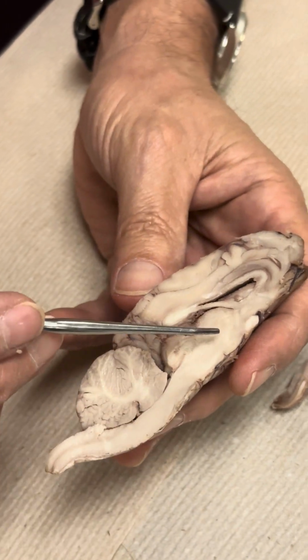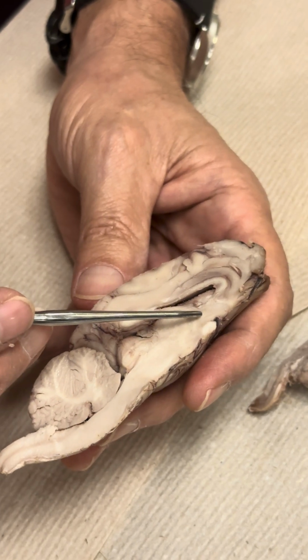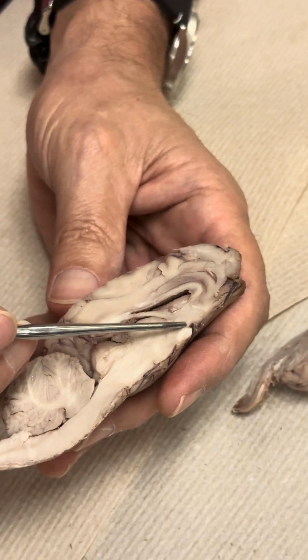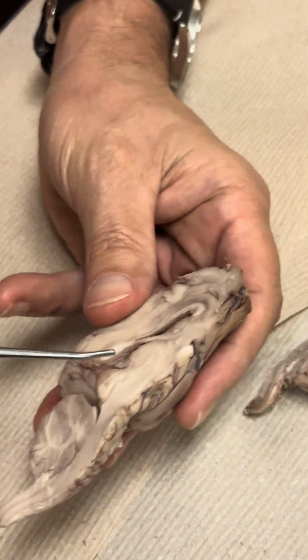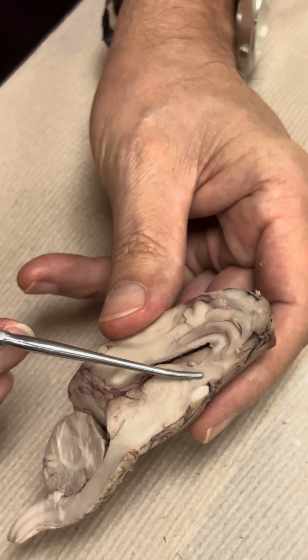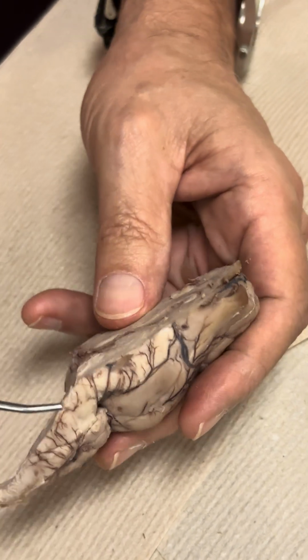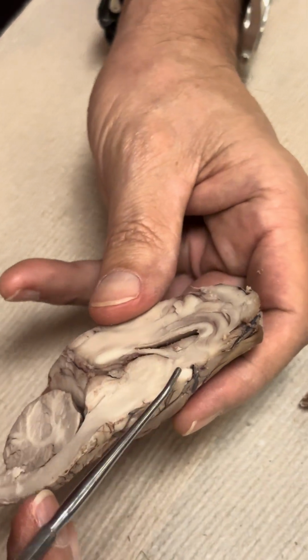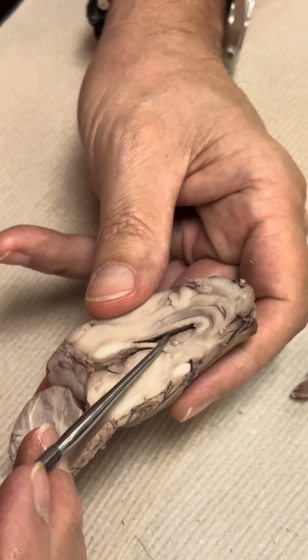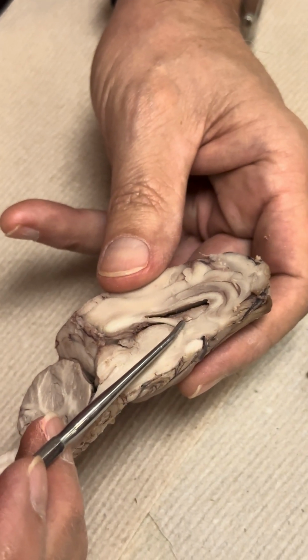All right, so this is our left thalamic hemisphere. This is our hypothalamus. Where's the hypothalamus? Below the fornix, inferior to the lateral ventricle, down here, inferior to the fornix.